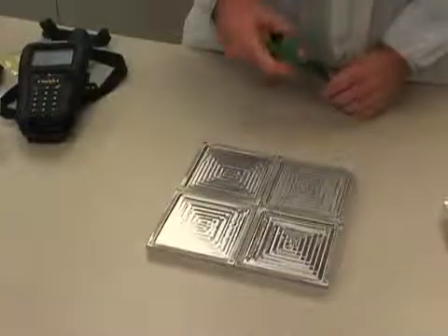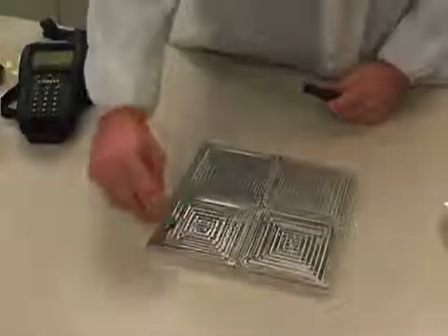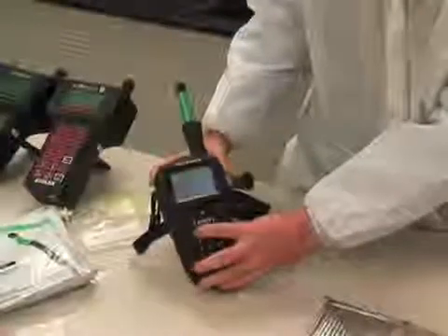Now we're going to swab the clean side of the stainless steel surface. First, we start with the Pocket Swab. Activate, shake, insert it into the device, press OK.